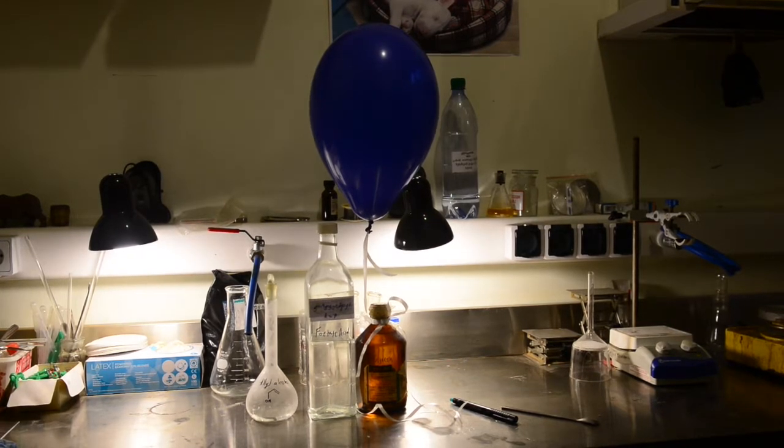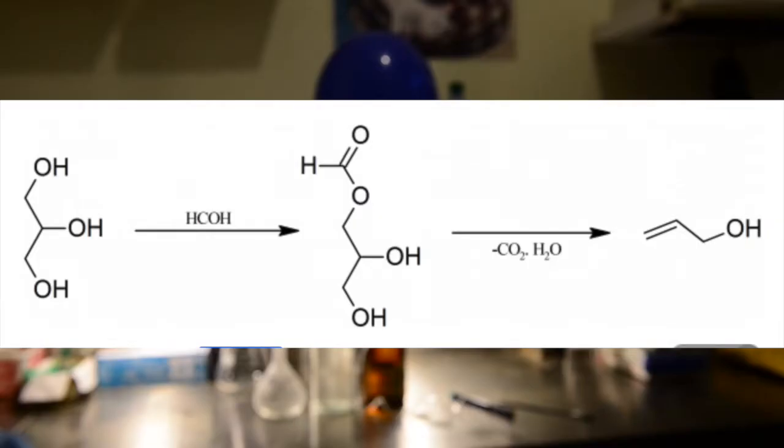We have been thinking about a very interesting substance to synthesize but first, we have to make our building blocks. I am not going to tell you what we are cooking here yet, but the first building block we produce will be allyl alcohol. A very interesting compound.